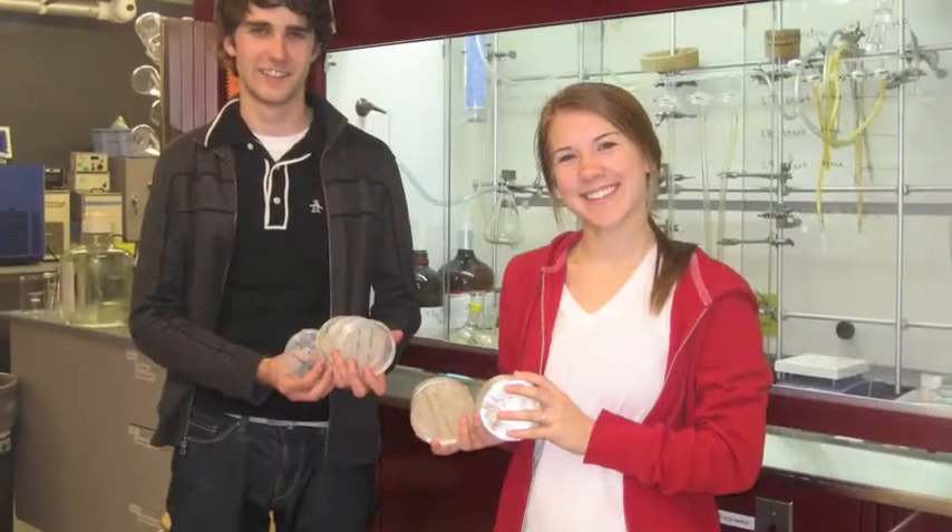In the beginning, one of Jenny's students taught us to pour plates, and it was sort of funny because he was like, 'You don't know how to pour plates?' He went through it really slowly and was really nice about it, and then towards the end we were like, okay, three liters of media today — this is sort of tedious.